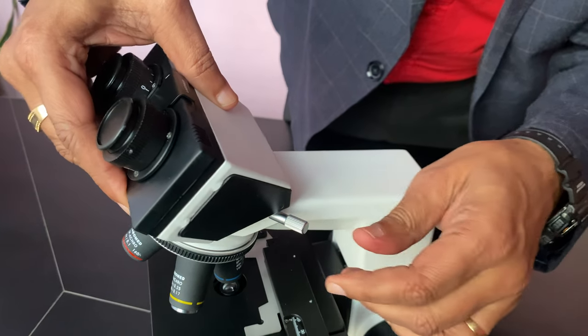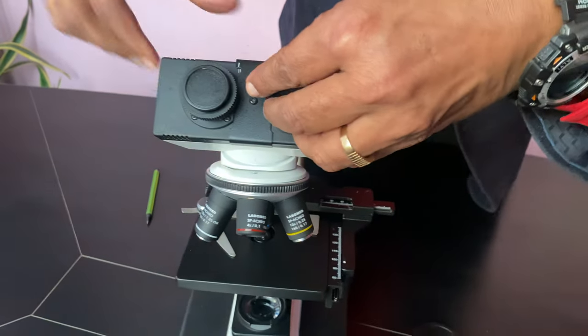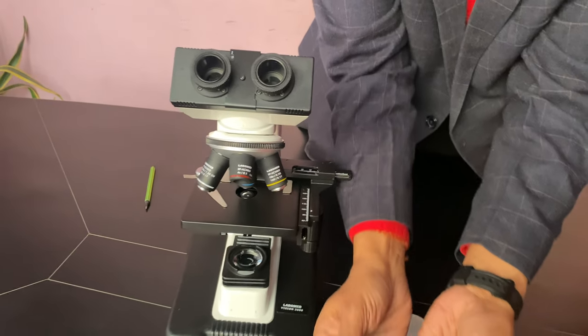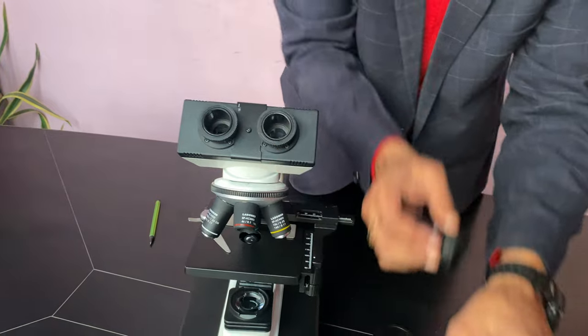Check it so that it moves only and doesn't come out — it will not come out. For removing, there are two eyepieces. You have two eyepieces with eye cups. Both of them you have to place here.